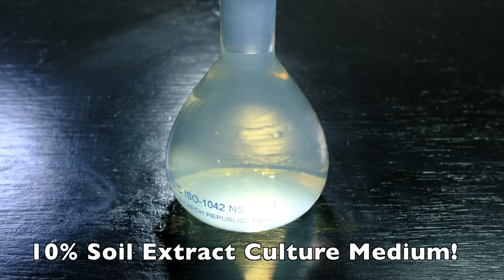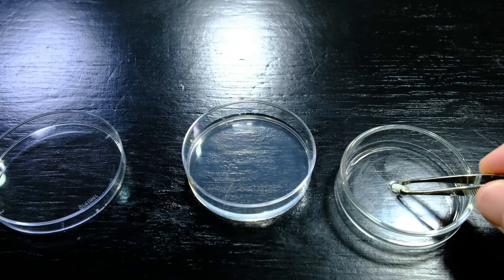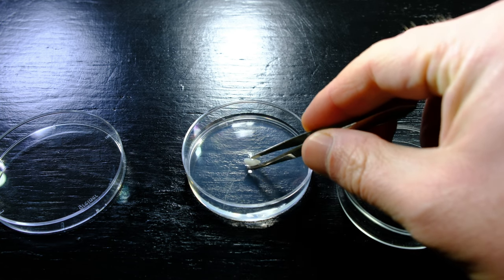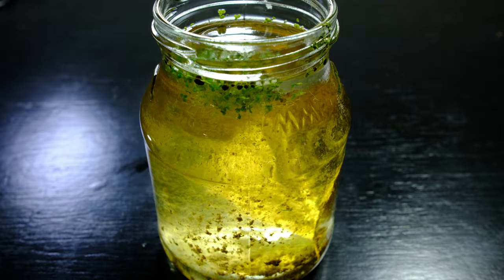You can proceed to prepare one or more Petri dishes and pour sufficiently but not too much culture medium into the dishes. Add the soaked rice kernel to the culture medium in the Petri dish. Each Petri dish needs a kernel of rice, so prepare this beforehand. Then we are ready to add the amoebas.